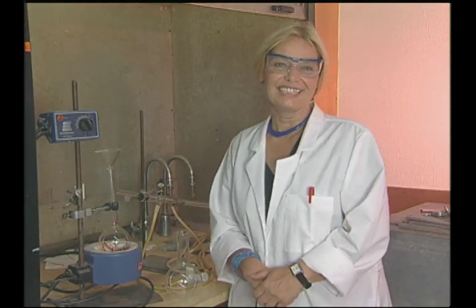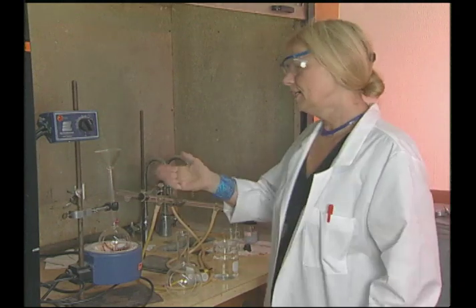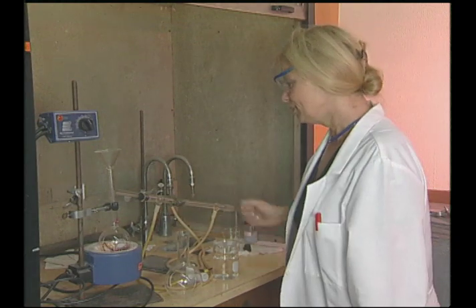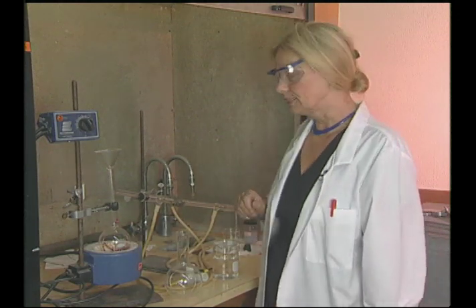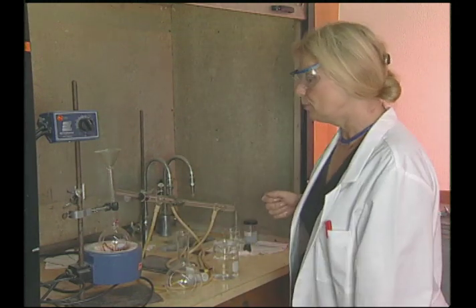Hello, we are now ready to do some experimentation here in our lab, which is not the most modern at the time, but remember the old chemists also worked in more historical conditions. So we have here a setup which we call the distillation apparatus. We have a heat source. This is a very modern heating mantle.